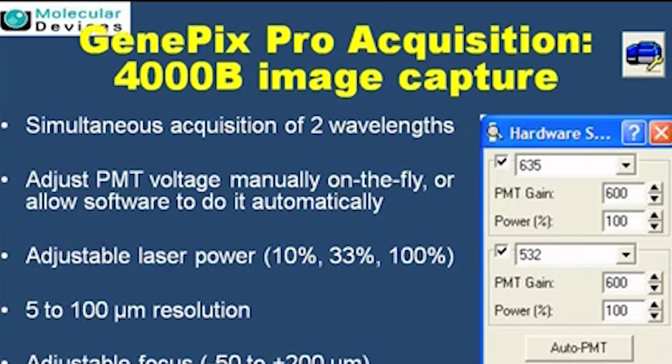Towards the right hand side, you see the pane where you have a hardware control button. There you can also look at all these different images which are now suiting your own biological applications. I think it will be more clear when we are actually looking at your software interface. Sure.